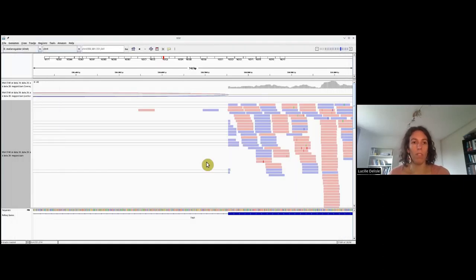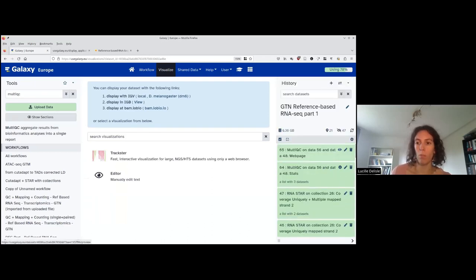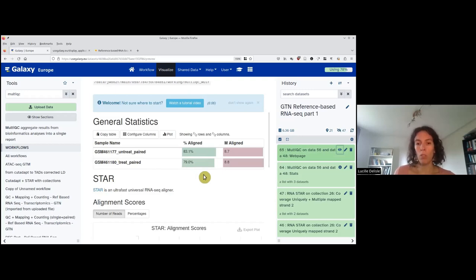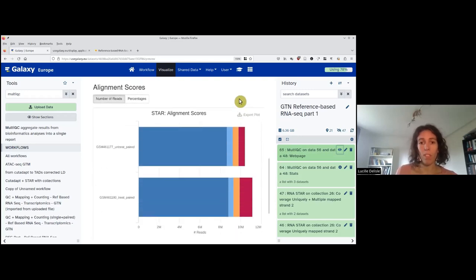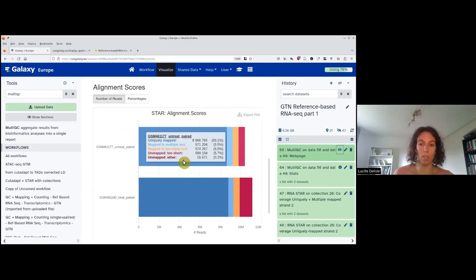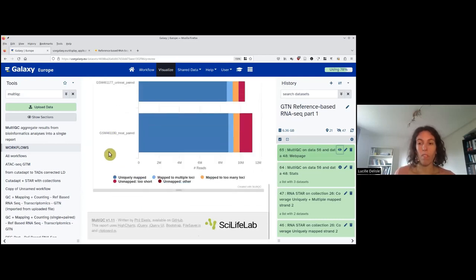Let's go back to our MultiQC result on the STAR log. We have information on the percentage of pairs that uniquely mapped — around 80%, which is good; everything above 70% is really good. There is also a bar plot showing how many were uniquely mapped, mapped to multiple loci, mapped to too many loci, or were too short. We discarded everything below 20 base pairs but some reads were still too short to map, giving about 5% too-short reads for one sample and 11% for the other.